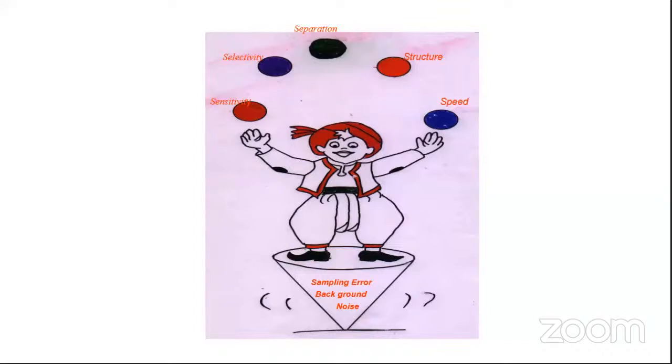Even if the concentration of a compound is at a picogram level, you can still find out the structure of a compound. The mass spectrometer and the chromatography combination makes it very, very selective. Chromatography is used for separation. So even if you have a complex mixture, you can separate individual components and determine the structure of each and every component which is there in the mixture. Of course, you can get the structural information, and then the speed of analysis, which is very critical in industry. You can achieve all this information with a very high speed, because today most of the chromatography equipments are high throughput equipments.